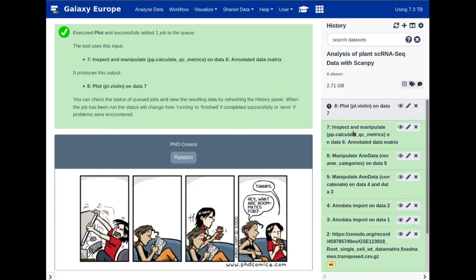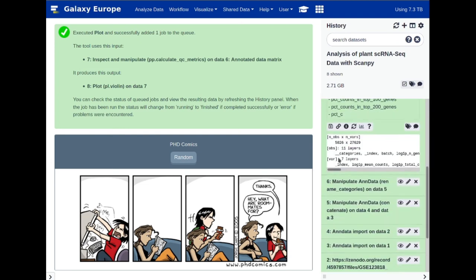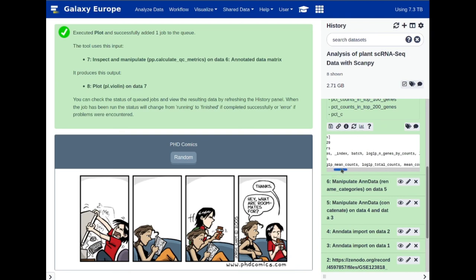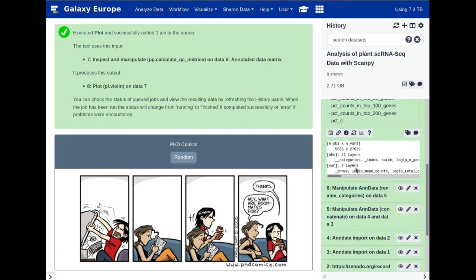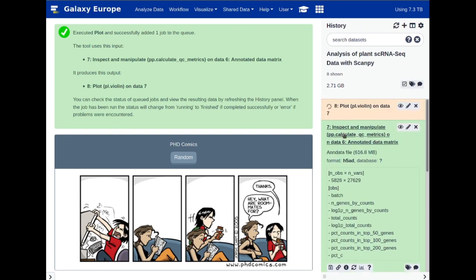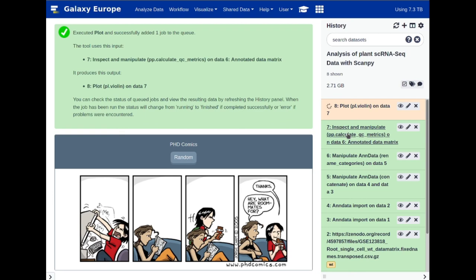We should notice now that by performing the QC metrics calculation, we have gained a few more features: we now have 11 layers, including batch, log n_genes_by_counts, log total_counts, n_genes_by_counts, and percentage of counts in the top 100 genes, and so forth. The QC metrics step generates many types of annotations we can use later on for further analysis, but right now we are just interested in the violin plot.